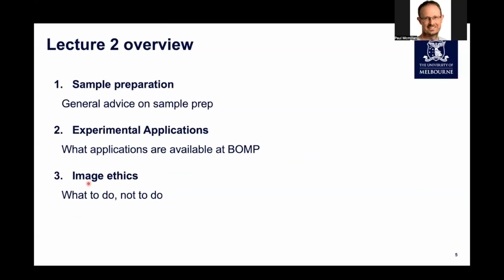All right, so lecture 2 is split into 3 parts. We'll start off with sample preparation, and here I'm going to give very general advice, as there's a wide range of samples possible on the microscope, so it's very difficult to give direct advice. For experimental applications, we'll focus primarily on the applications available within our platform, although those are more widely available if you have the relevant equipment.